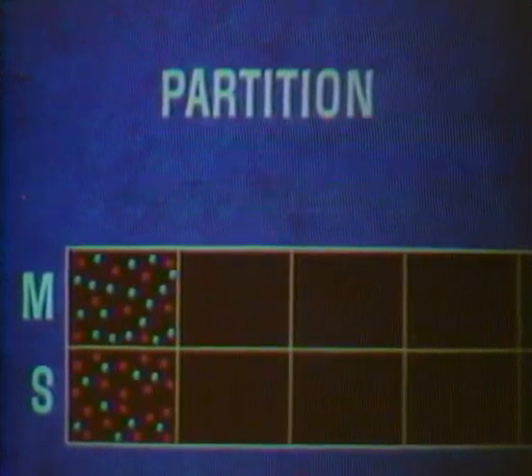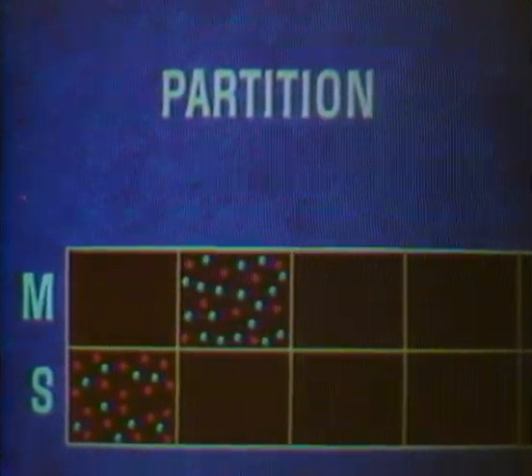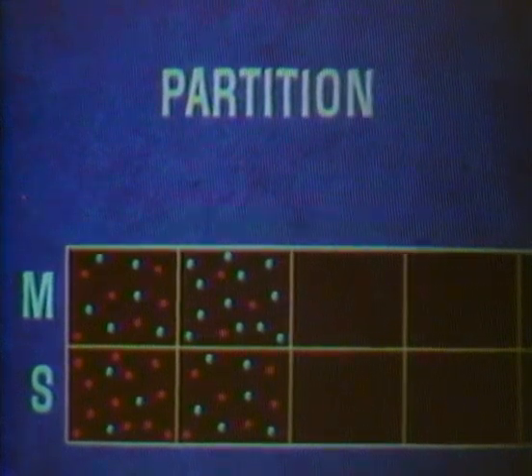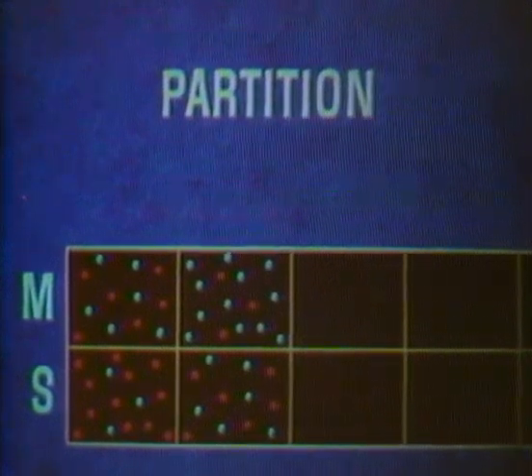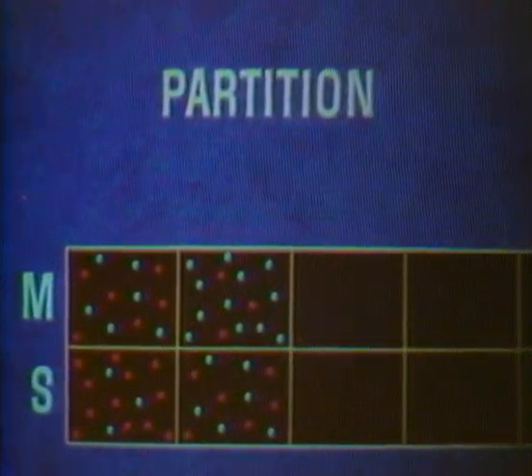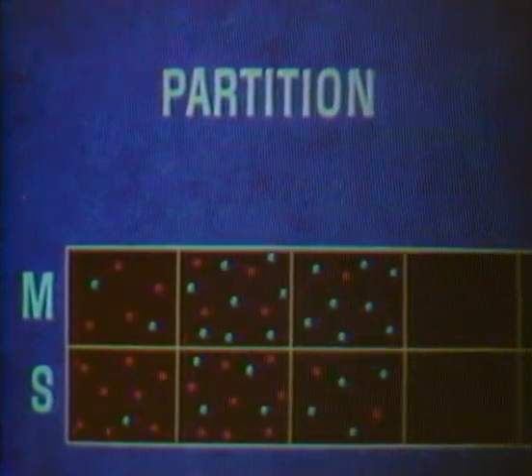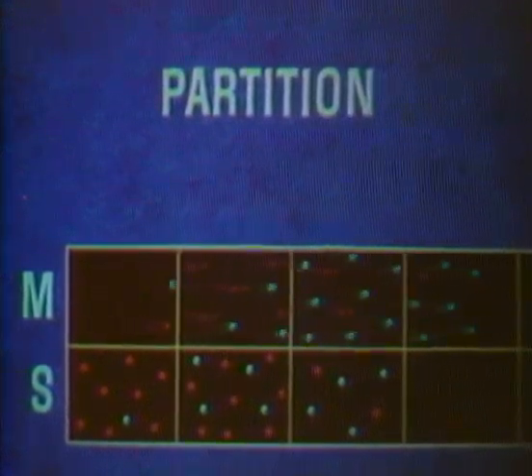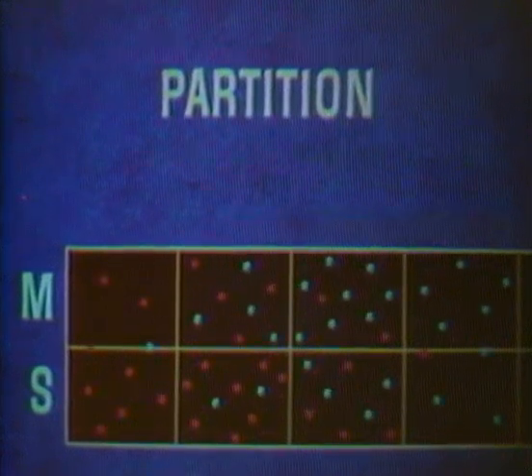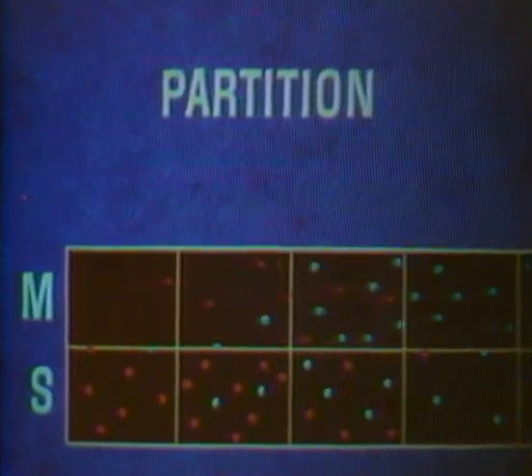Now let's move the mobile phase to the next step, or plate. Equilibrium will be established in both plates, and the same ratios will hold for the distribution of the molecules of each component. This is constant under identical chromatographic conditions. We continue to move the mobile phase along, simulating in this step manner the flowing stream. With the blue component moving more rapidly than the red, the separation becomes successively greater. If we go on for many more plates, the blue will eventually be completely separated from the red.